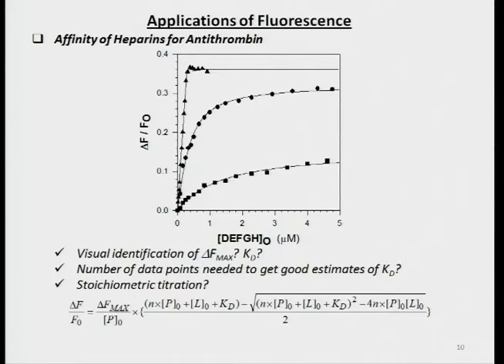So in essence, you need a minimum of 10 data points. The higher the number, the better, to reach the saturation level. 80% saturation is something you should strive for, and that is typically a believable experiment. Anything less, you can always question.